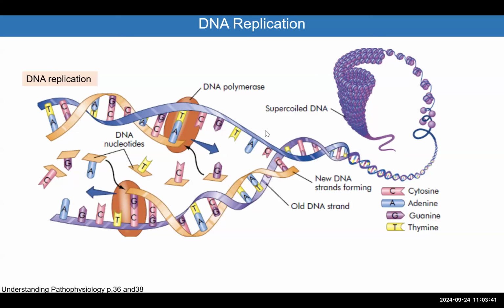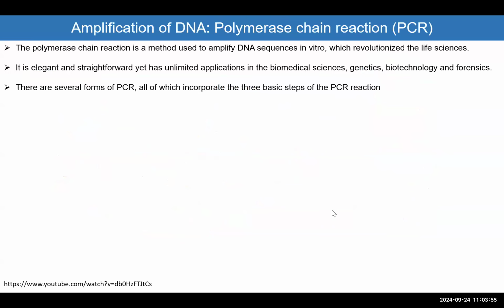In other words, if I want to amplify only this fragment from the T up to this guy here, all I need is just to design primers that fit on both sides, and then I will generate this fragment. So let's dive into the DNA amplification by PCR. So this would be the second component that we will mention.